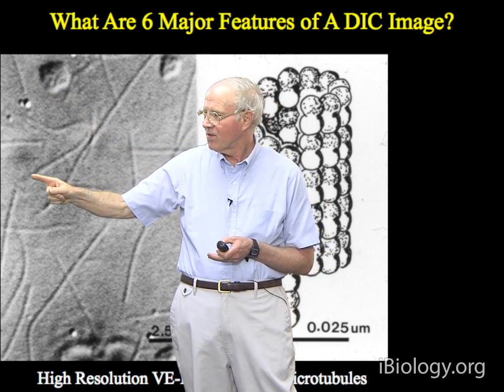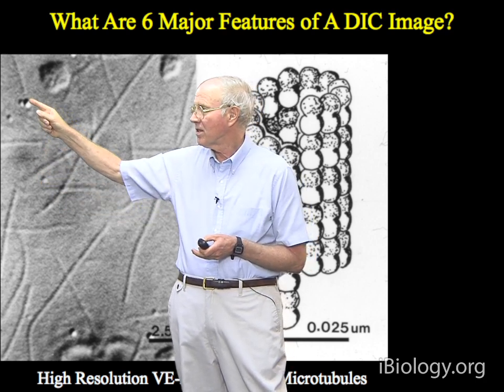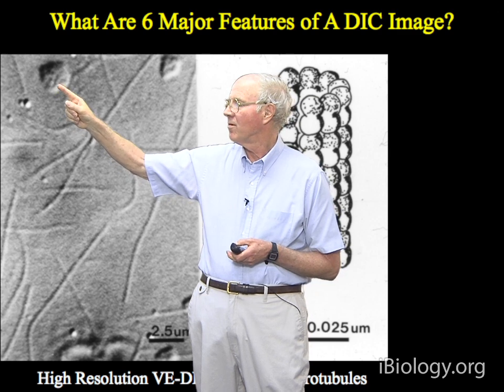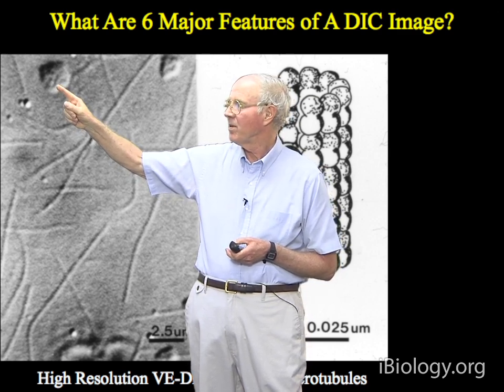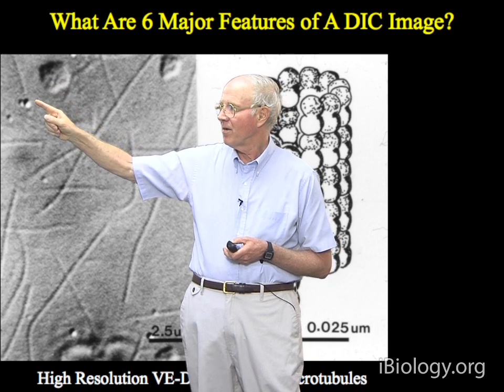And again, we can take the same analogy here. If you take one of these particles and think of that as a unit scatterer in this vesicle right here, we still have black, white, and then here, all of a sudden, we now have black and white overlapping each other, overlapping each other, so we get the same contrast as the background.